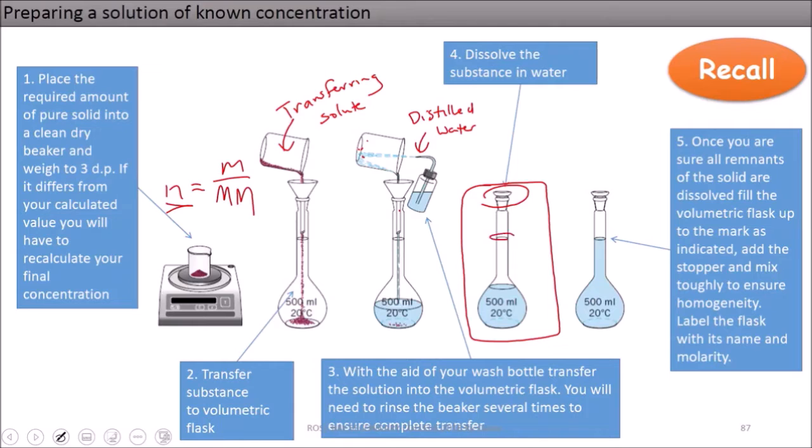So if I have my fingers wrapped around and then my thumb on top, looks really awkward, but like that. Invert it, so invert up, down. You don't need to shake it. If you shake it, you might have everything spill all over you. So I recommend just invert it a couple of times, and once you see no more solids, then you know it's completely dissolved. Once you've done, add water all the way to the line.